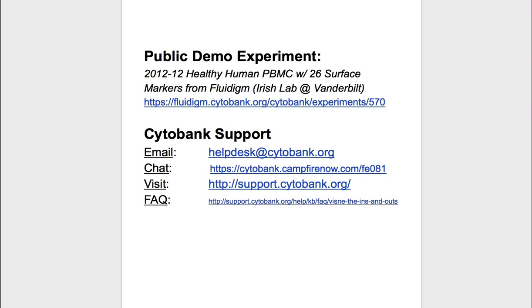This concludes the introductory video on viSNE. The data shown are courtesy of the Irish Lab at Vanderbilt University and are publicly available on the Fluidigm Cytobank server at the address shown.